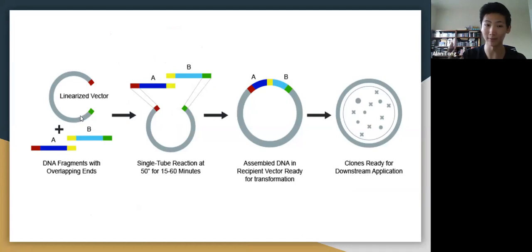It's very simple now, right? We simply just match up those ends. This one is complementary to that one, right? This one is complementary to that one. This one is complementary to that one. If you have all of these in the master mix and you have Gibson assembly do its thing, right? Exonuclease, annealing, polymerase, ligase, right? That just keeps on going inside of your reaction mixture. You will get all three of these circularizing together to form your vector, to form your final recombinant DNA.